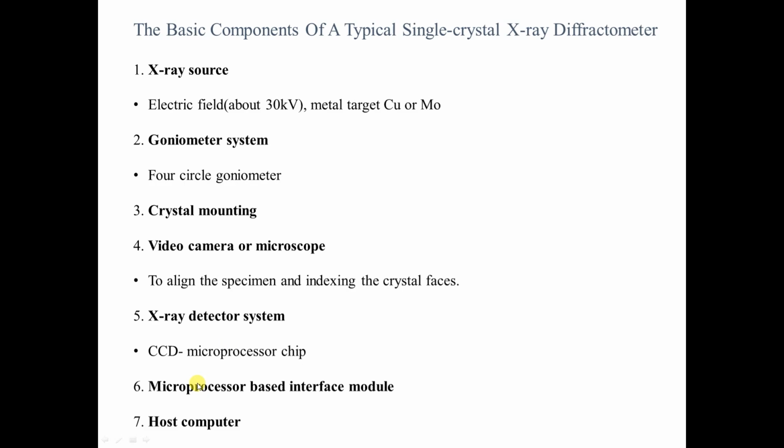That connects the instrument with the host computer, which comes with software packages where the reflections recorded in the detector are processed to get a diffractogram.